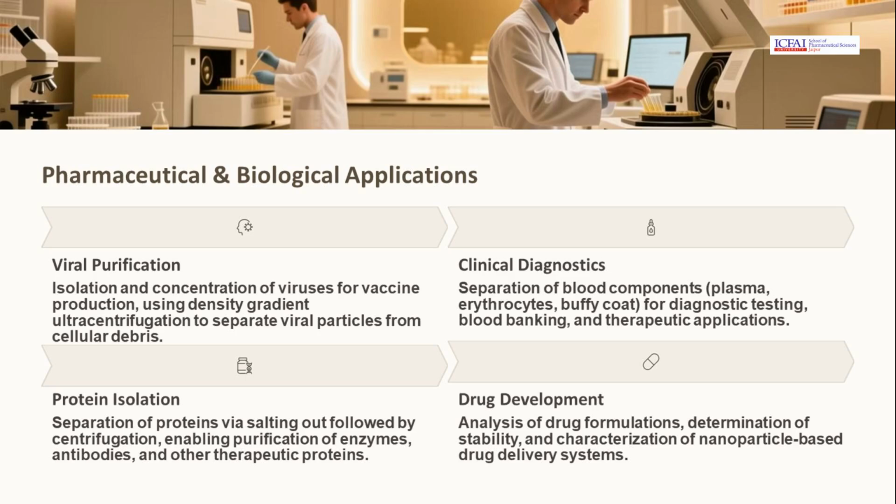In pharmaceutical and biological fields, centrifugation is used for viral purification, clinical diagnostics, protein isolation, and drug development. It enables the separation of blood components for testing, purification of therapeutic proteins, and analysis of drug formulations, demonstrating its critical role in advancing healthcare and research.